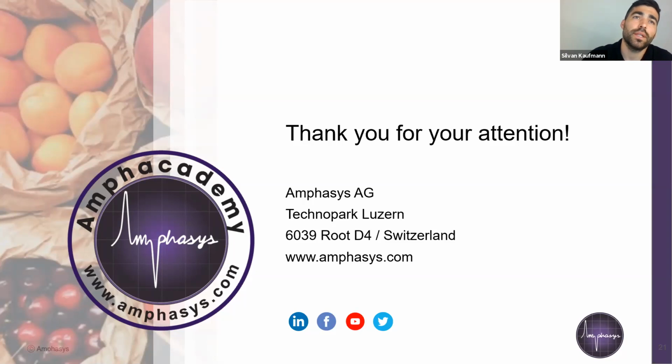Okay, thank you. And another question, whether we can measure more than 10,000 cells in a measurement. Of course, that's possible. That's not a big deal for us. It will increase the duration of the measurement. And in the end, it's also dependent on how many cells you actually have in the buffer. Otherwise, you will run out of sample. But it's possible, though we recommend 10,000 cells because you will get a statistically robust result out of them. Measuring more does not increase the accuracy much further, and it does not really benefit. It just takes longer.